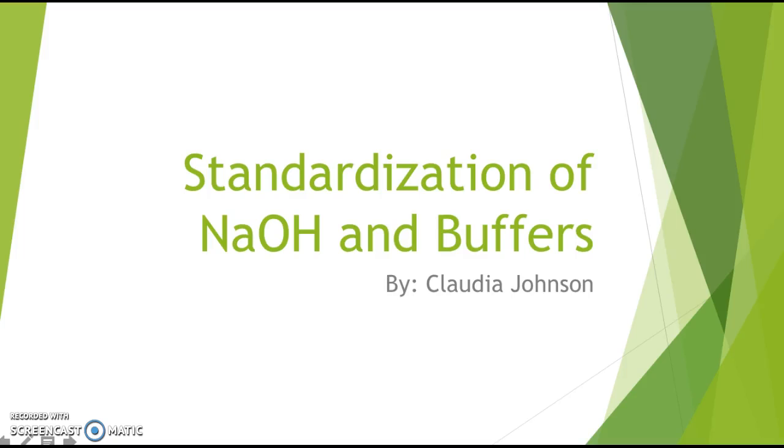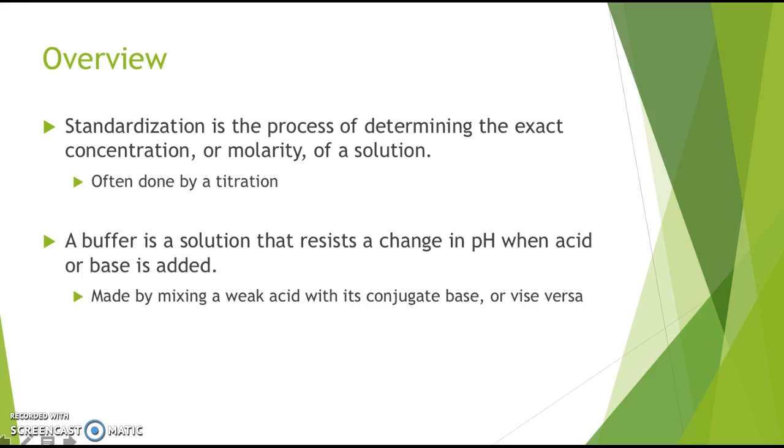Welcome to the standardization of NaOH and buffers. Standardization is the process of determining the exact concentration or molarity of a solution. This is often done by titration, using a primary standard like KHP, freshly boiled water, and the proper indicator.